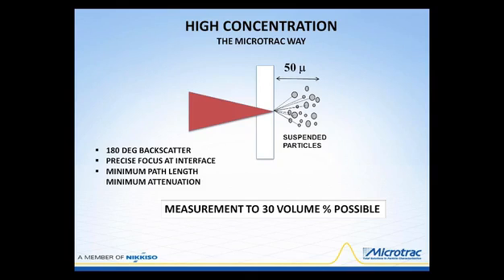So that extends the concentration range up another order of magnitude from that graph that I showed you at the beginning.